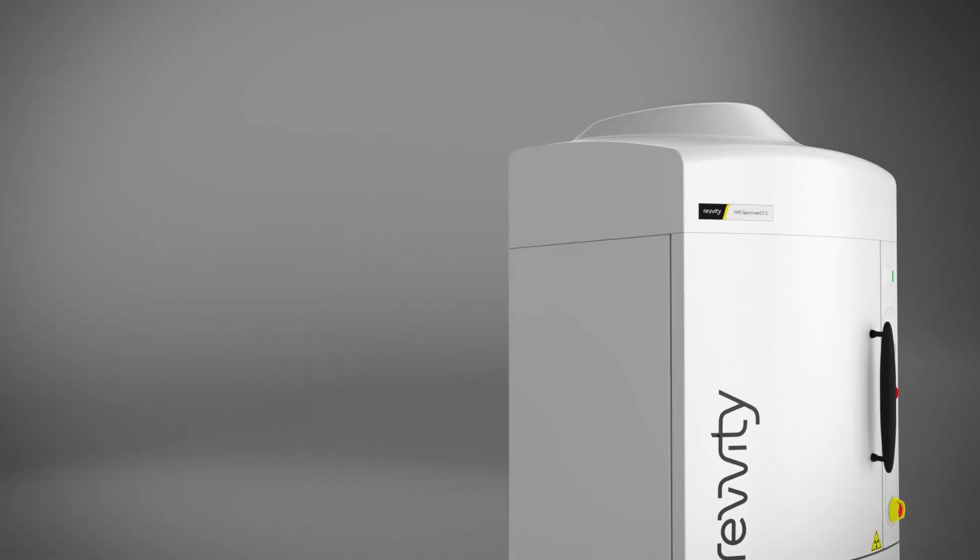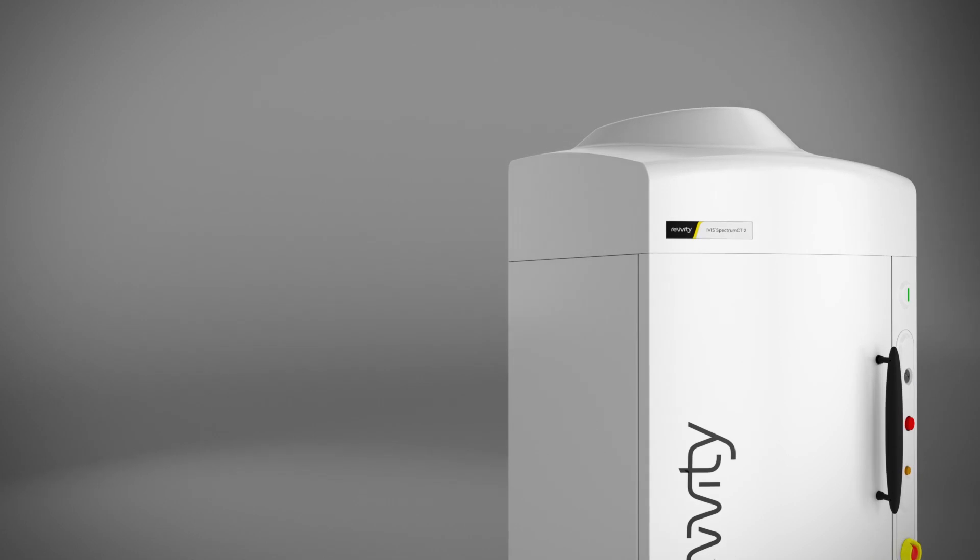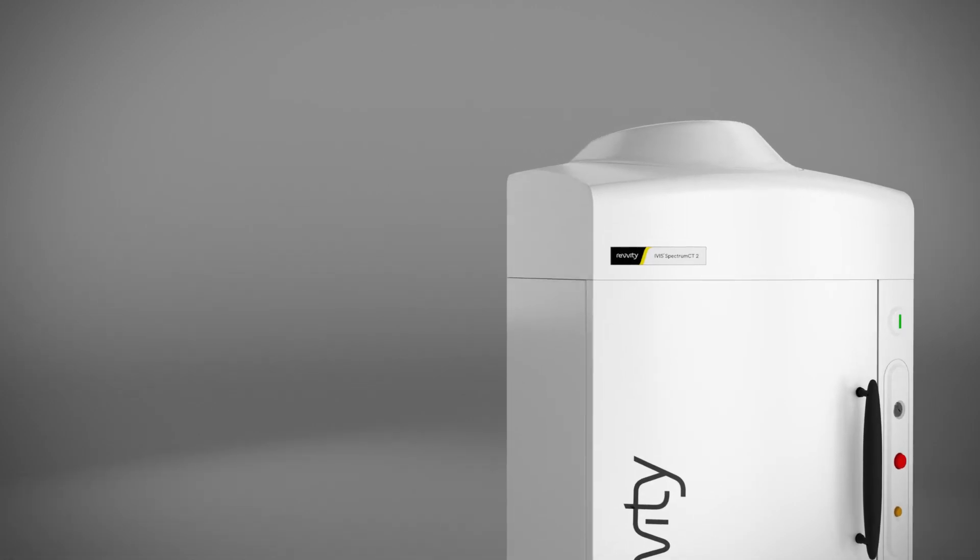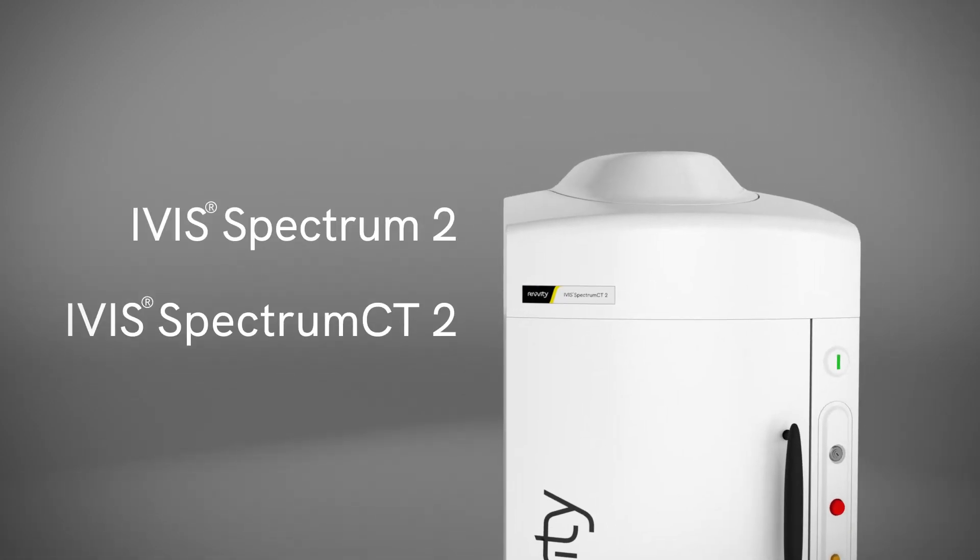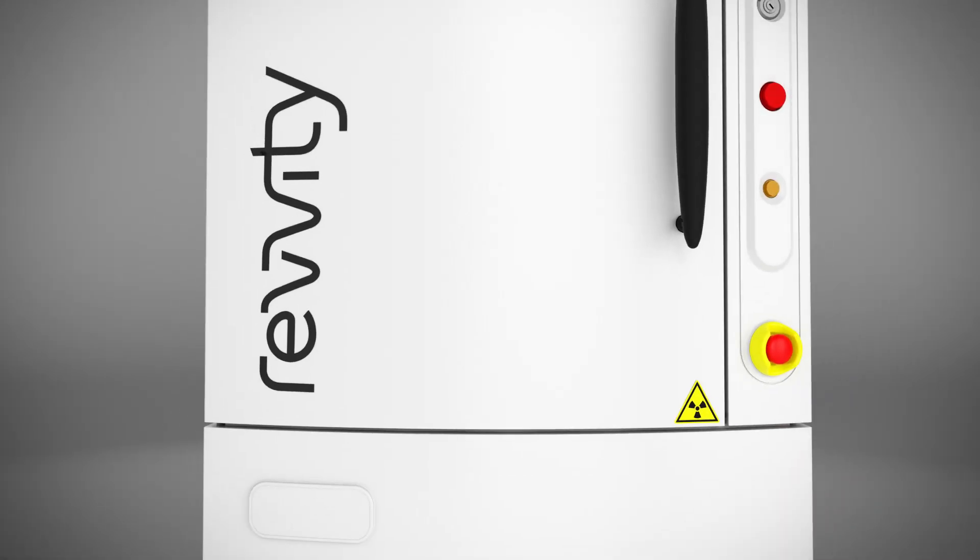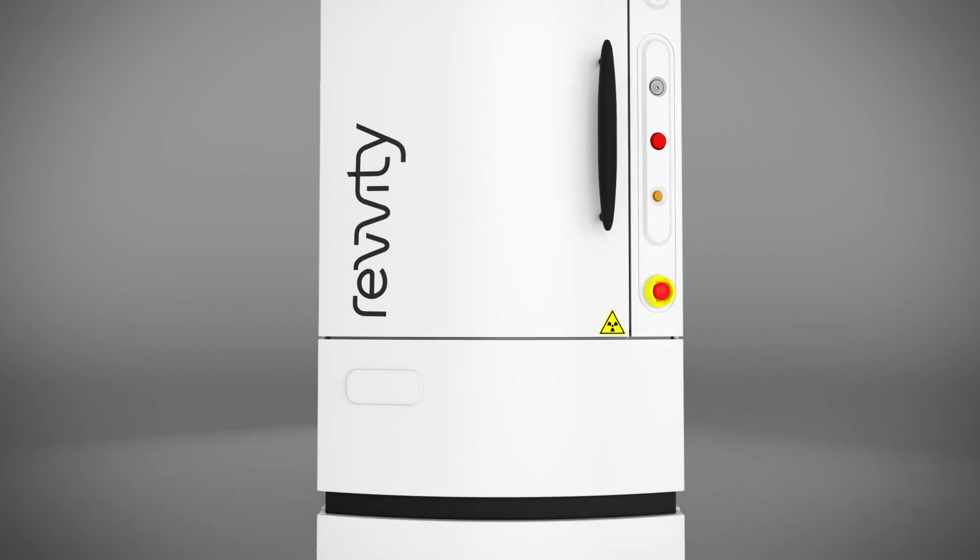Introducing the next generation in optical imaging, the IVIS Spectrum 2 and IVIS Spectrum CT2 imaging systems.